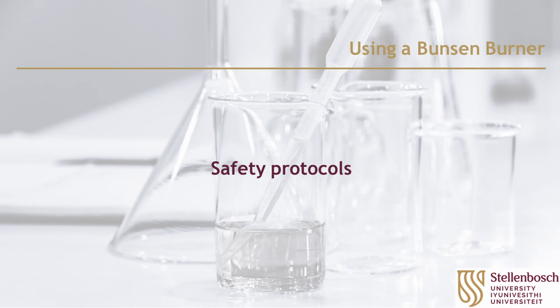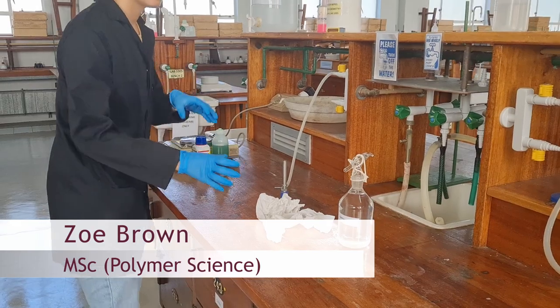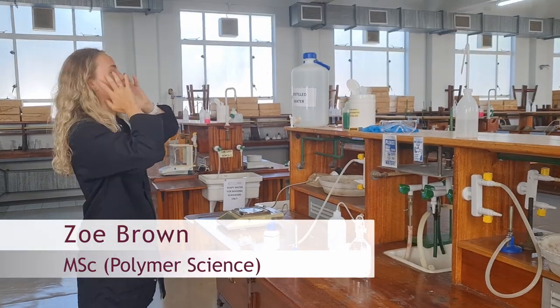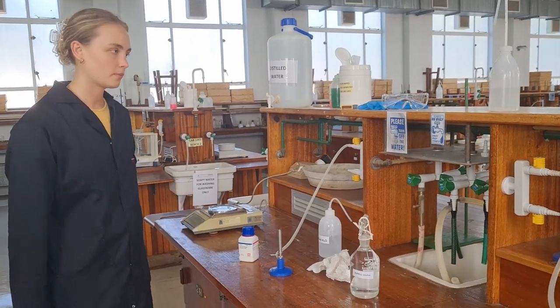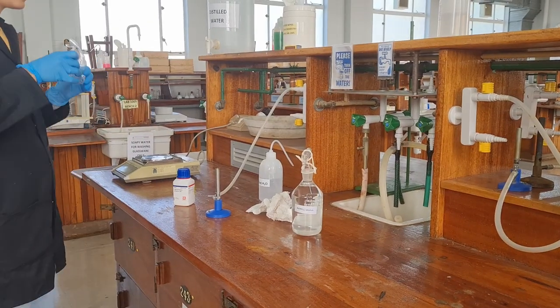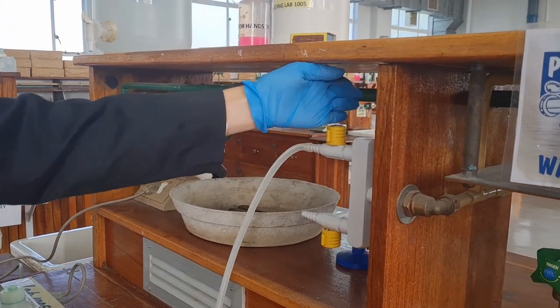Safety protocols. Before you start, make sure that the area around the Bunsen burner is clear from paper, clutter, and solvents or anything that is flammable. If you have long hair, make sure your hair is tied up and be cautious of any loose clothes or jewelry. Make sure that all the gas vents are closed before you start and that the tubing is secure.